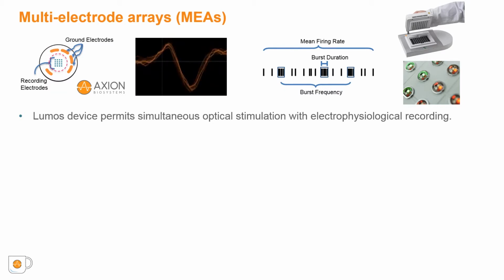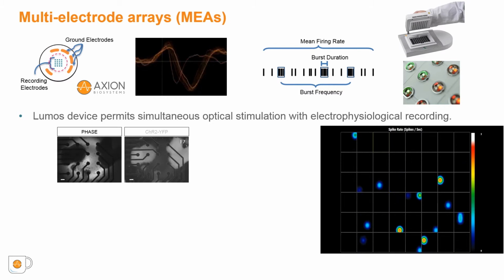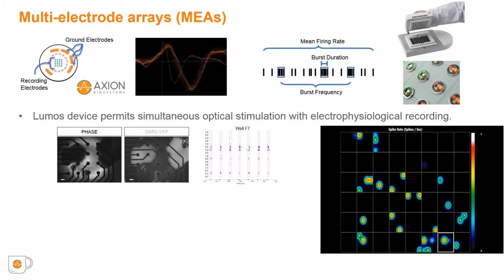We created co-cultures on a 48-well MEA plate, shown in this video, which is sped up 2 times. Each flash represents spontaneous activity in the corresponding well. Shown here is a representative well, where the electrode grid as well as motor neuron clusters expressing channel rhodopsin can be seen. When we begin to provide blue light stimulation, you can observe the synchronized activity within the same pictured well.